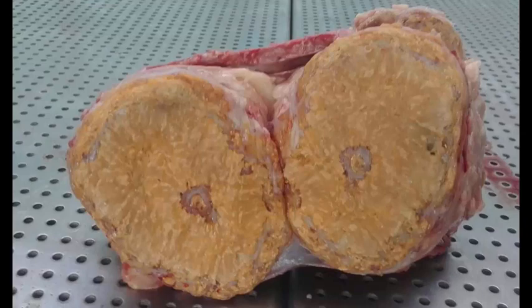You can, but you probably have a higher incidence of false negatives. Mycobacterium paratuberculosis causes Johne's disease. The lesion in the lymph node will be histiocytic or granulomatous, but will not have this characteristic appearance.